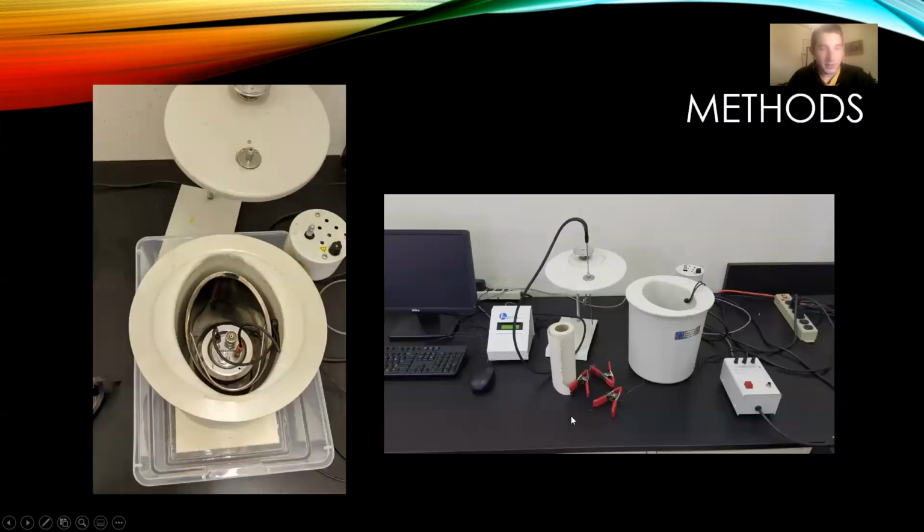And here are some pictures of what the actual experimental setup looks like. This is the actual bomb calorimeter that was used in the experiment.